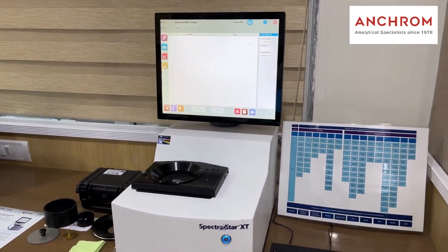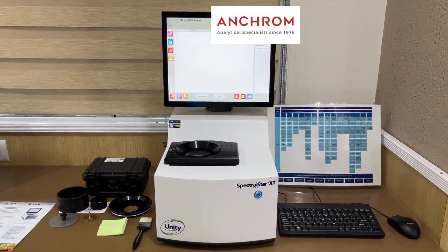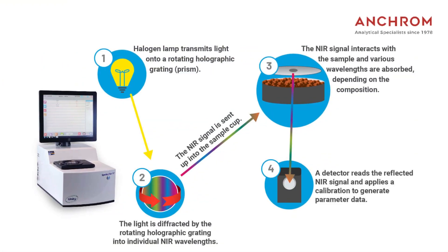This instrument is perfect for food analysis applications. The SpectraStar XT series NIR analyzers utilize scanning monochromator technology for the highest signal quality available. These systems utilize near-infrared light and precisely measure absorbance at each wavelength. Robust calibrations transform this spectral information into multiple constituent values that cannot be quantified through visual inspection.